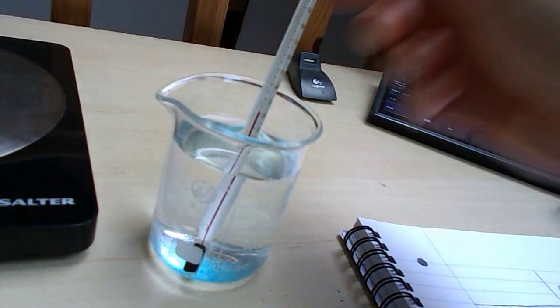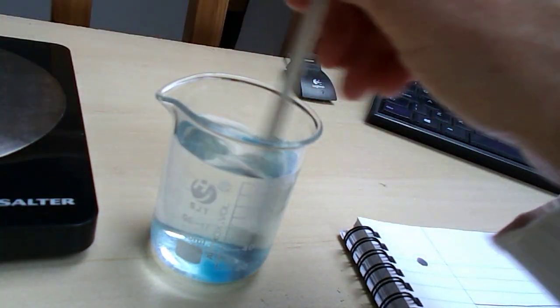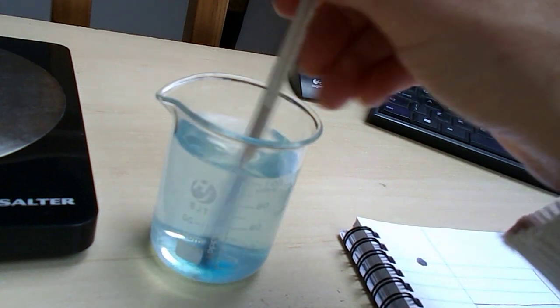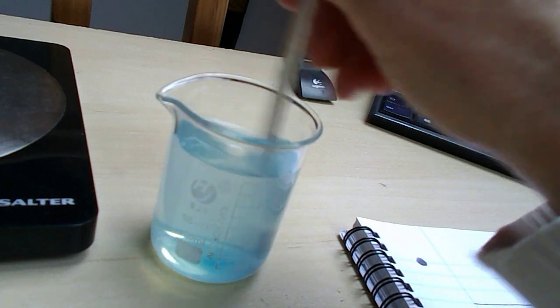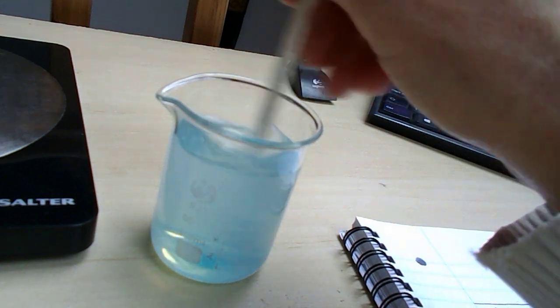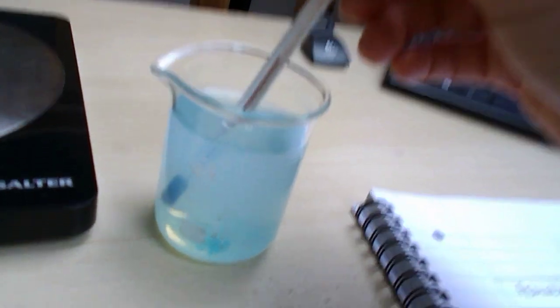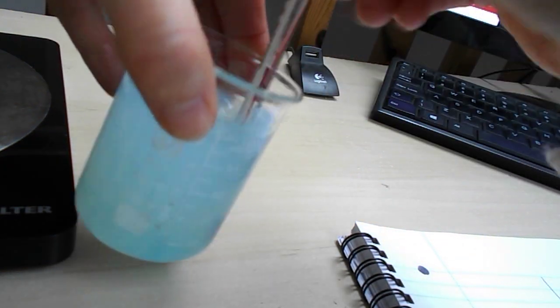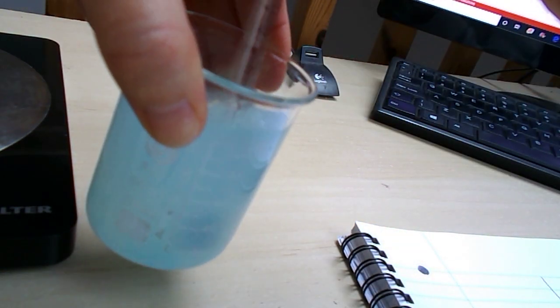And then I'm going to use the thermometer here to give it a bit of a stir. Normally we'd use a stirring rod, but I haven't got one of those either. I need to borrow a few more bits and pieces. Can we see that that is starting to dissolve? If you look carefully, you might be able to tell, let me see if I can hold it there so you can see, that there's still a bit of solid left at the bottom. Okay, so that's okay for now. So we're going to dissolve, dissolve, dissolve.